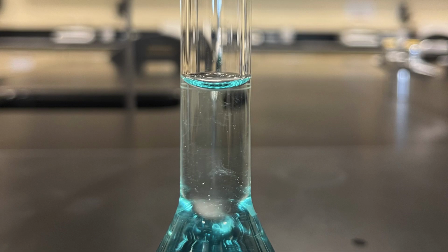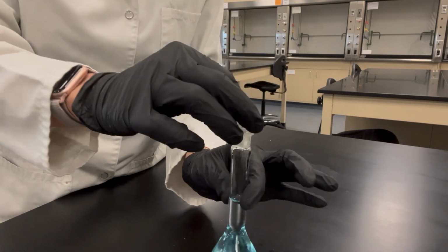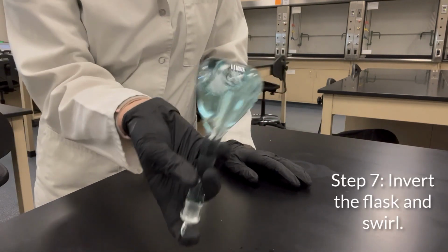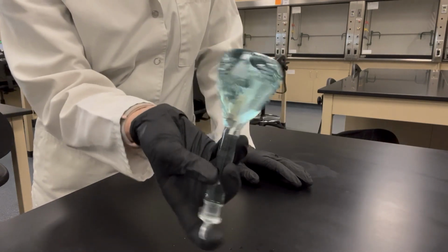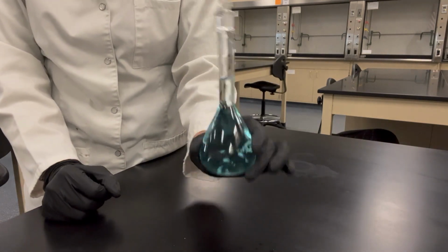When the meniscus is resting right on that line, then we will take the top for the volumetric flask, securely place it in there, and we can invert the volumetric flask and gently swirl to make sure the whole solution is mixed. And now we have successfully diluted our solution.